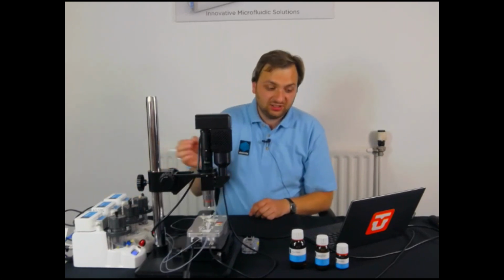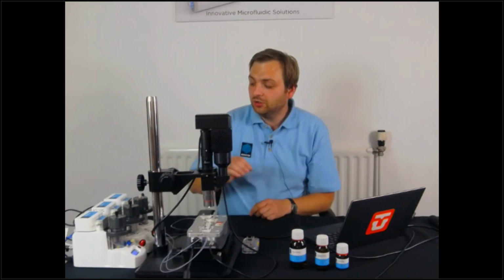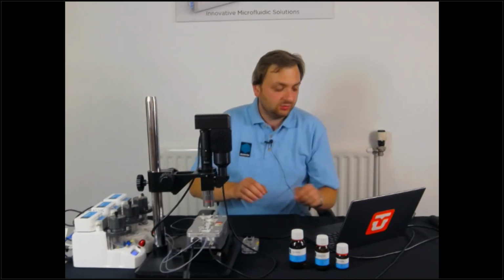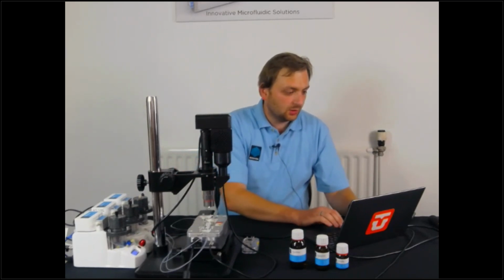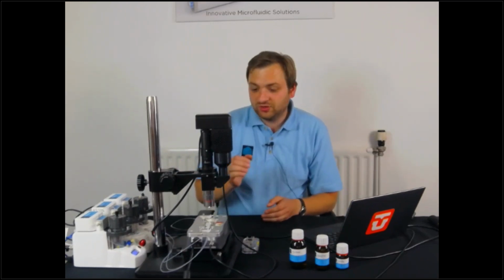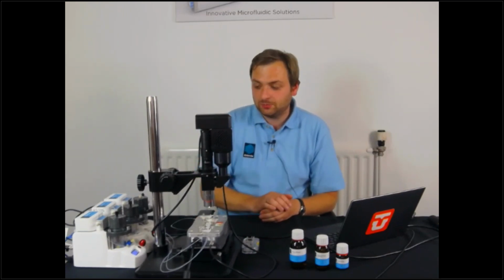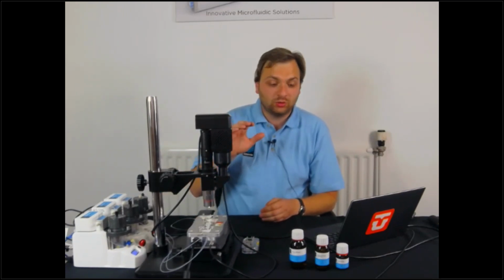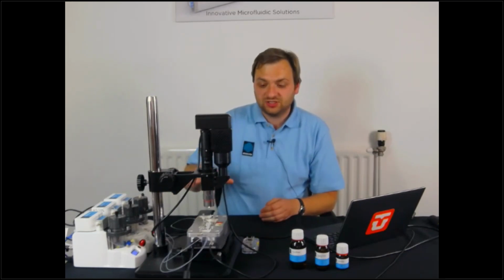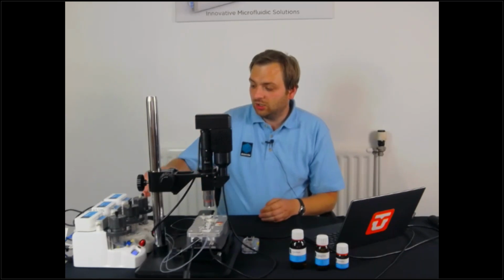That flow sensor is a heat trace flow sensor, so it doesn't interfere with the flow, but it measures flow rate down to 0.1 of a microliter a minute. So that generates very precise flow through the system. And the system has the capability to operate in pressure control mode or in flow control mode, where we set a flow and the system will automatically adjust pressures to match that flow.